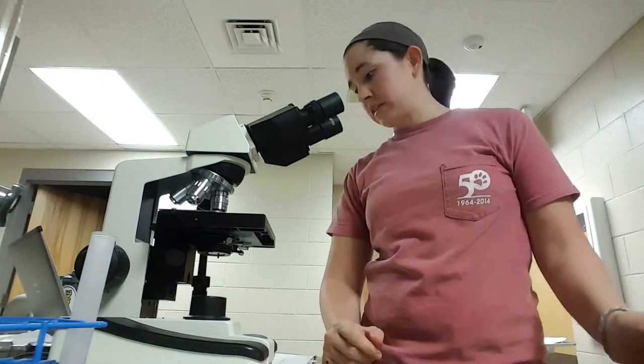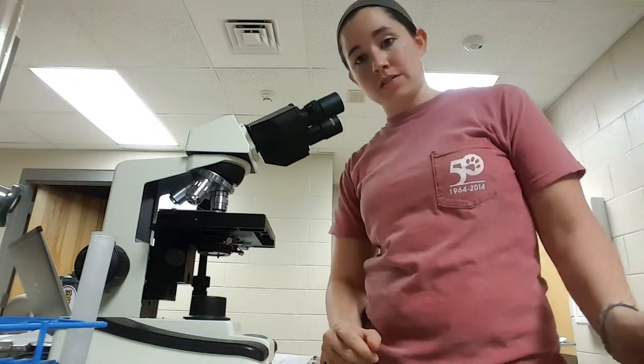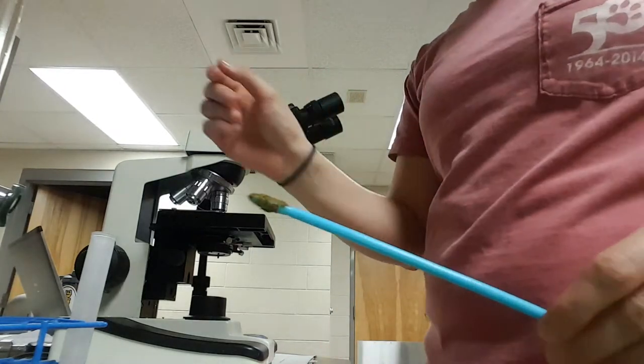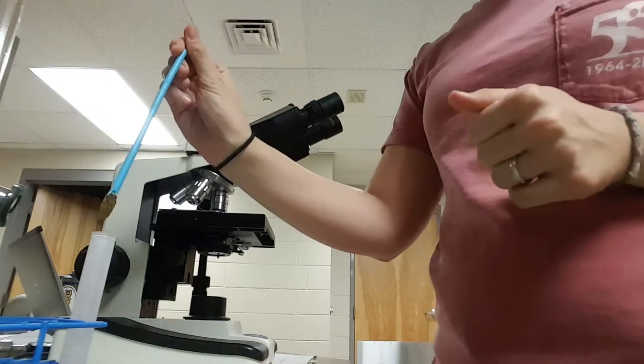Hi, my name is Brooke Armstead and I'm going to perform the task of fecal flotation. I have a small amount of feces here on my fecal loop and I'm going to place it in this test tube here in the test tube rack.